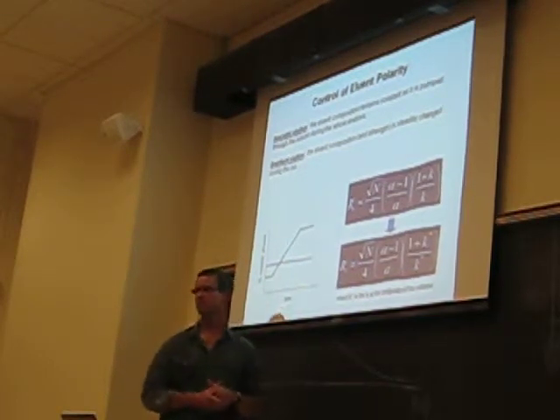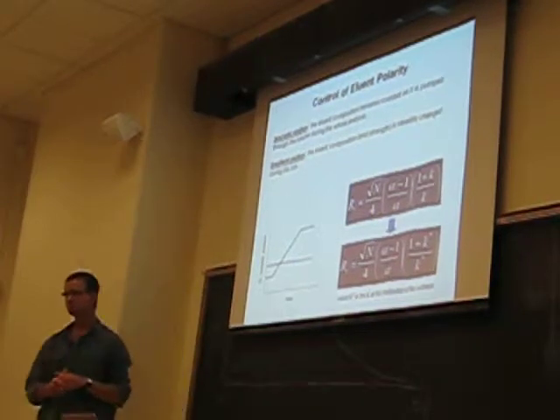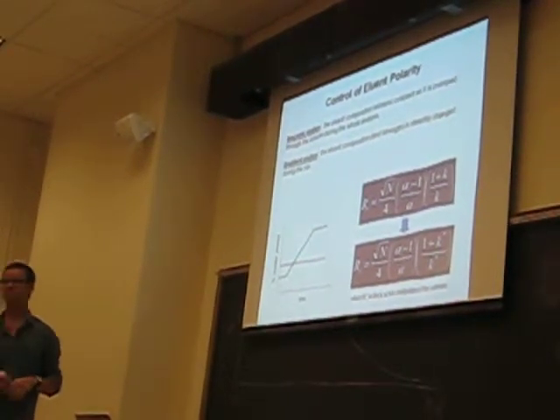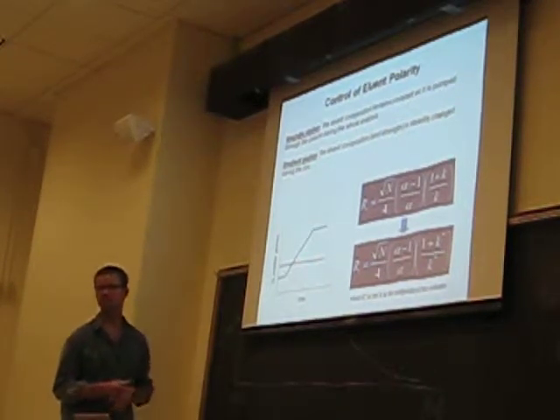So this resolution is specific to the method for analytes tested in that method? Yes. Exactly. That's right.